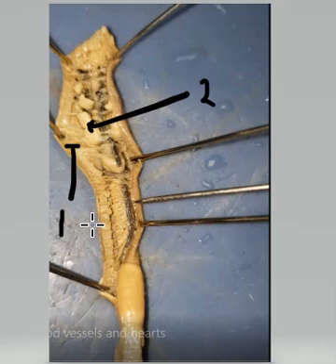Notice that there are internal dividers. What are these internal dividers called? That's what I've highlighted for number 1. And then secondarily, I want you to be really generic with number 2. That's where the answer key might be kind of helpful.